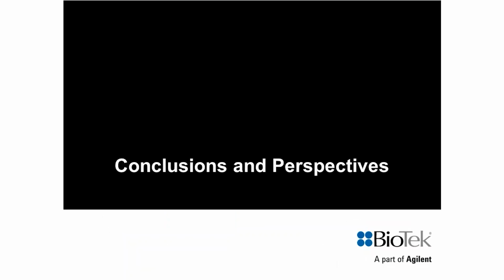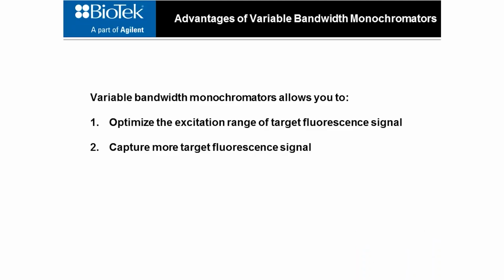Now, to wrap up, what I showed you is some of the difficulties working with multiple fluorophores and a way to bypass those kinds of challenges, which are to establish the ideal excitation and emission ranges using lambda stacks, as well as linear unmixing.